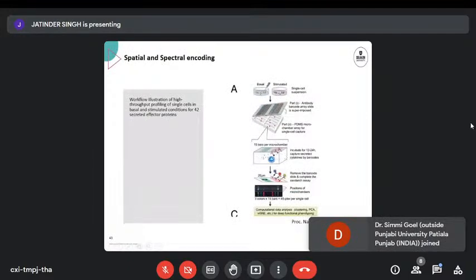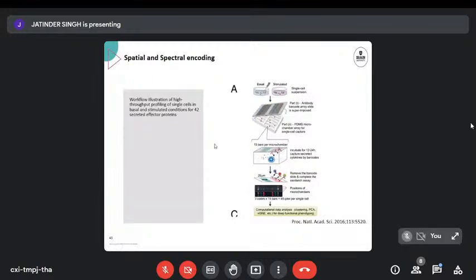Imaging after a little while allows you to measure the fluorescent signal if a detection agent is being added as well, and allows you to do multi-cell profiling using an immunoassay at a single cell level. So we have a container here, and lots of containers, with a single cell sitting in each individual box. We have a range of different affinity agents patterned in a line because they're placed perpendicular. A whole range of different assays can be done on the secretome of this little cell, and then a detection antibody can be added later on, and you can get dynamic plots of how the different protein levels excreted change for this cell population.